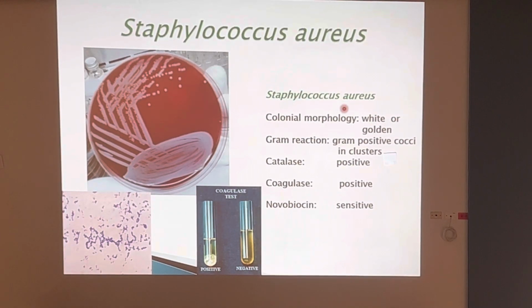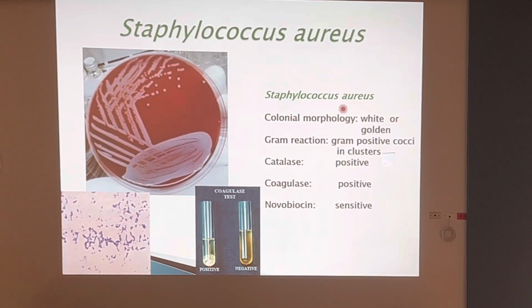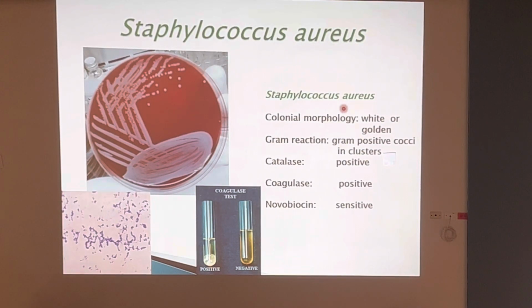So I cultured on my blood agar. These colonies grew. I did a gram stain from these colonies and found that they were gram-positive cocci. I'm thinking either staph or strep. As a matter of fact, I'm thinking staph because it's gram-positive cocci in clusters, but I'm not sure entirely. I can't just jump ahead. I must follow the method.